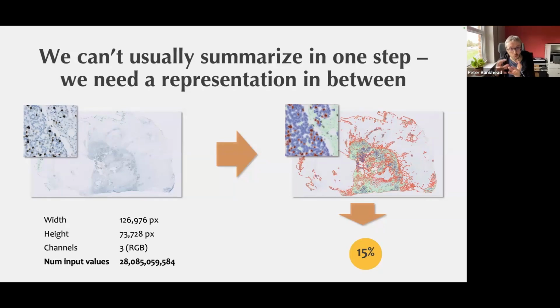And so the goal of the analysis is to get to the summary value, but it has to do that with some steps along the way. And ideally we would be able to visualize those steps along the way to actually find out if we've done something sensible and not just picked a random number as the output.